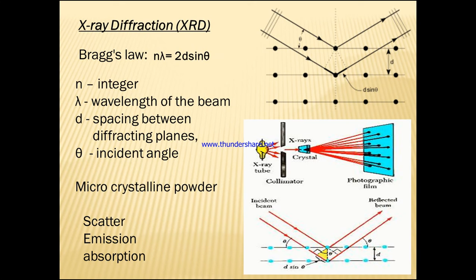When the electrons have sufficient energy due to the bombardment, as well as due to the collimator and monochromator, they have sufficient energy to dislodge inner shell electrons of the target material. When the high energy beam of X-rays hits the target material, the X-ray spectra are produced here.